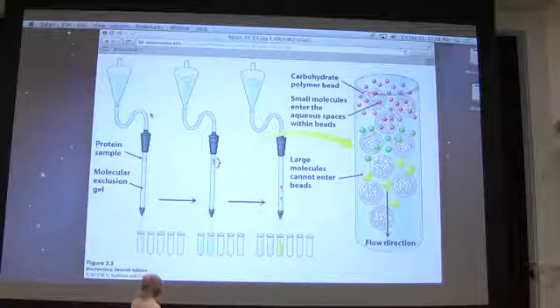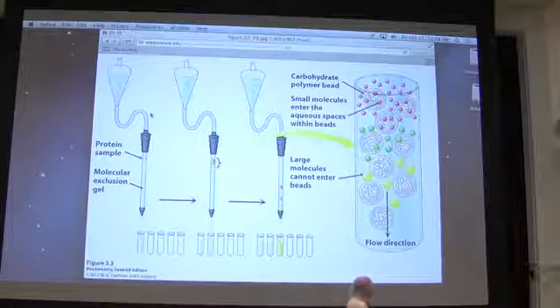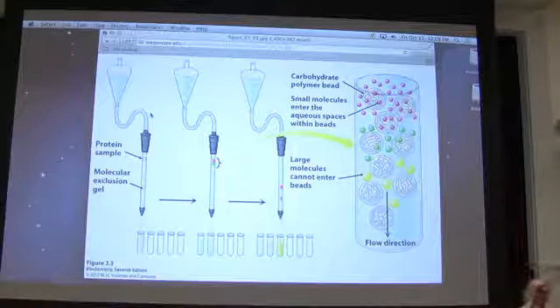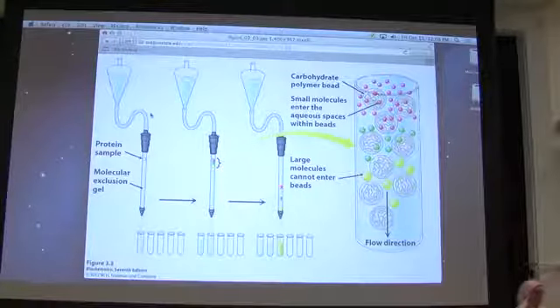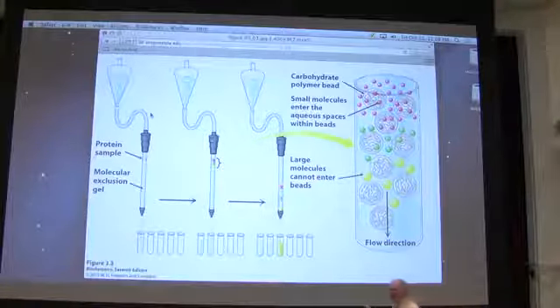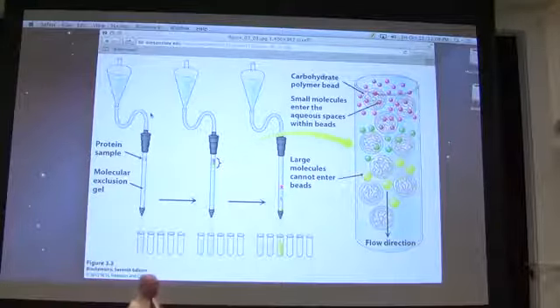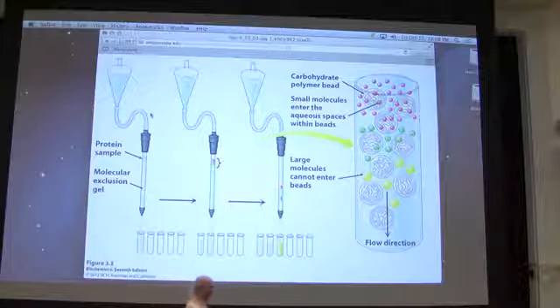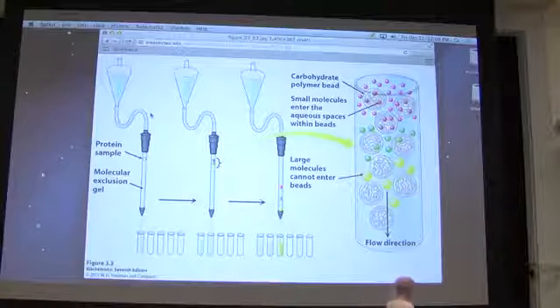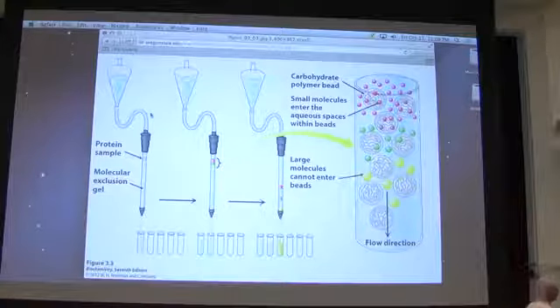As you can see on the enlargement, these are little round things, and this is a pretty big enlargement. It turns out that these materials, as we use them in the laboratory, are little tiny beads. Okay? Little tiny beads, maybe a millimeter or less in diameter. They're pretty small. Okay? But they have a really cool property. The cool property that they have is that they have holes in them, and the holes are connected to tunnels within them, and the tunnels go in one place and come out the other place. So things can travel through these beads.